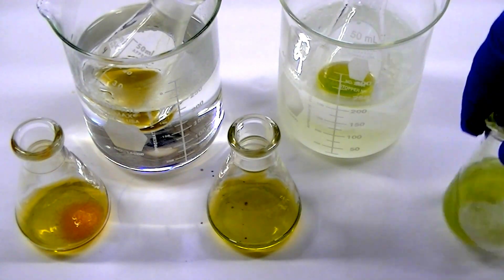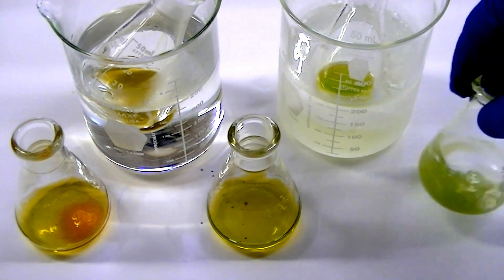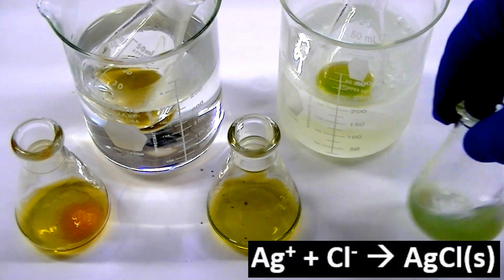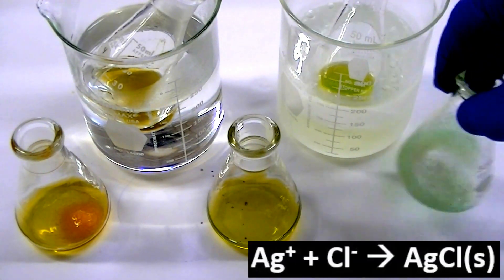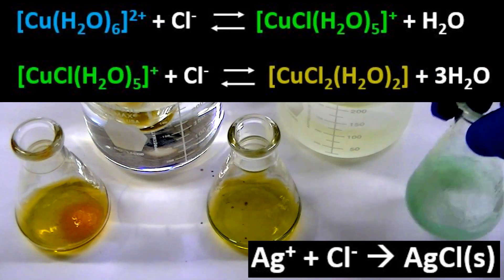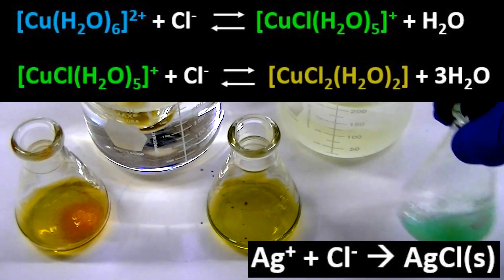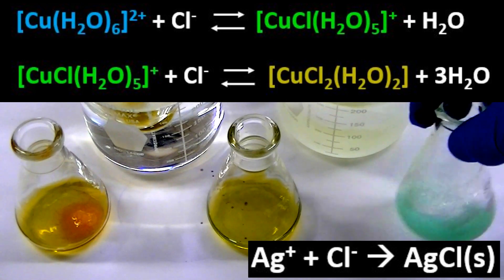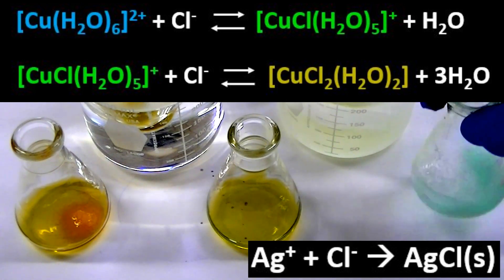The added silver ions precipitate out any chloride ions in the system. This chloride ion removal has the effect of shifting the equilibrium displayed above strongly to the left. This forms the free copper ion, which is blue in color.